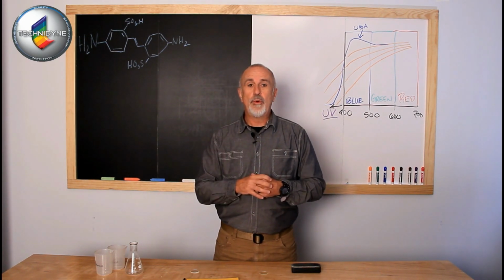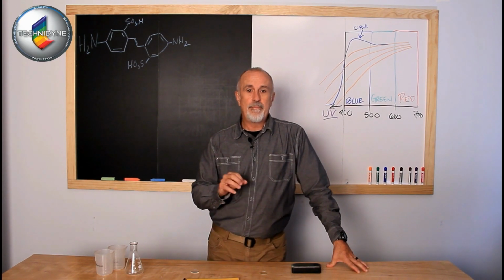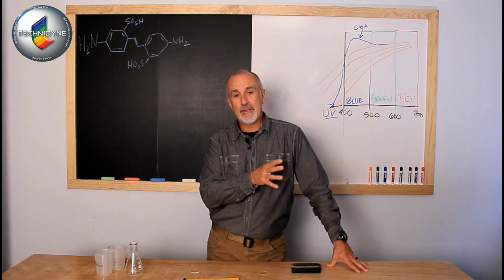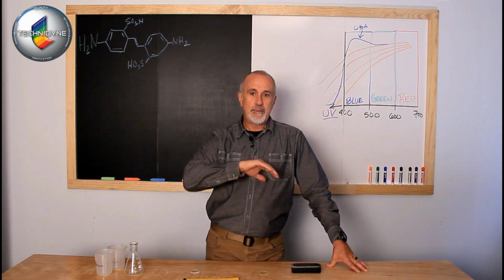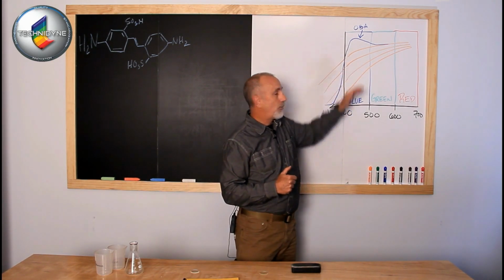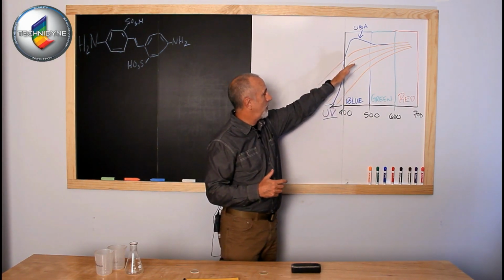It's important we understand what tools we have for evaluating that, and that's where the brightness measurement comes in as the primary tool that most people use when dosing and measuring the effect of an optical brightener. When we talked about brightness, we said its original setup was back in the 1930s by the Institute of Paper Chemistry and General Electric, and that unit was set up to evaluate the bleaching process. When ISO developed their brightness method, likewise, it was to monitor the bleaching process, and at the time, for the most part, we were dealing with naturally occurring colorants that we were removing in this process.